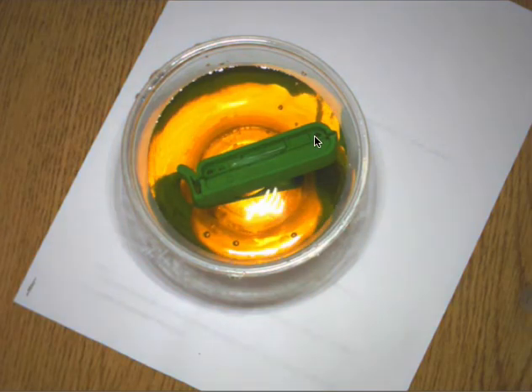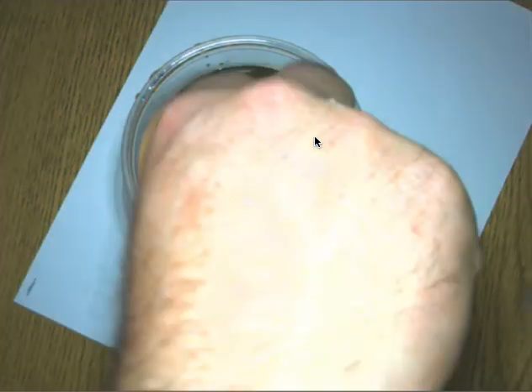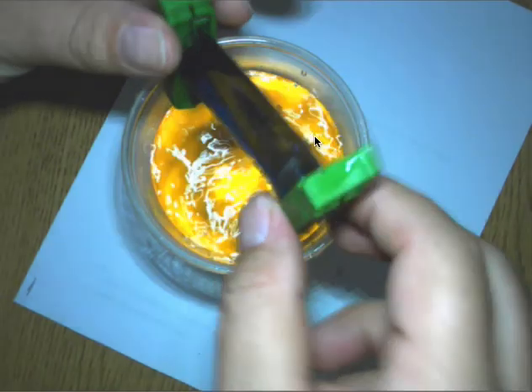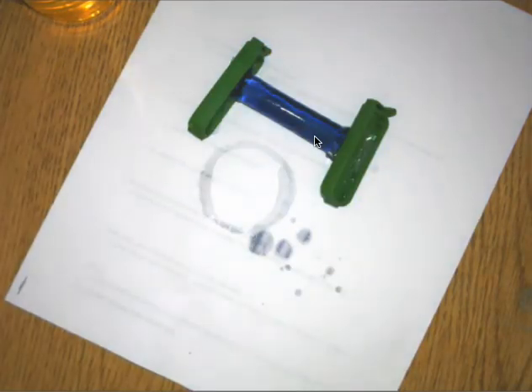Here we go. Let's take a look. It's been about 25 minutes or so since we last talked. So first off, let's take this out. Has the tubing changed? Well, you tell me. Has it changed? Yes, it has. So, what color is it now?